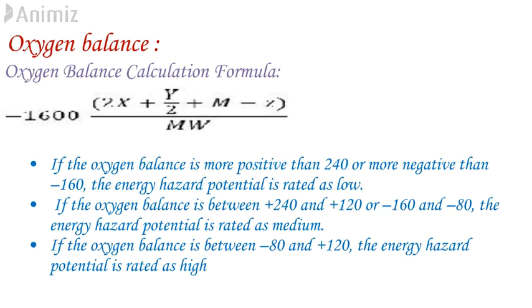Any substance with oxygen balance more positive than -200 should be treated as potential high risk and explosivity testing should be carried out. That oxygen balance shouldn't be relied on for all chemicals can be explained with the help of an example, MDC. Using the formula, OB for MDC can be obtained as -56.5. As per the severity scale, MDC falls under high severity, but in reality, MDC is not an explosive.